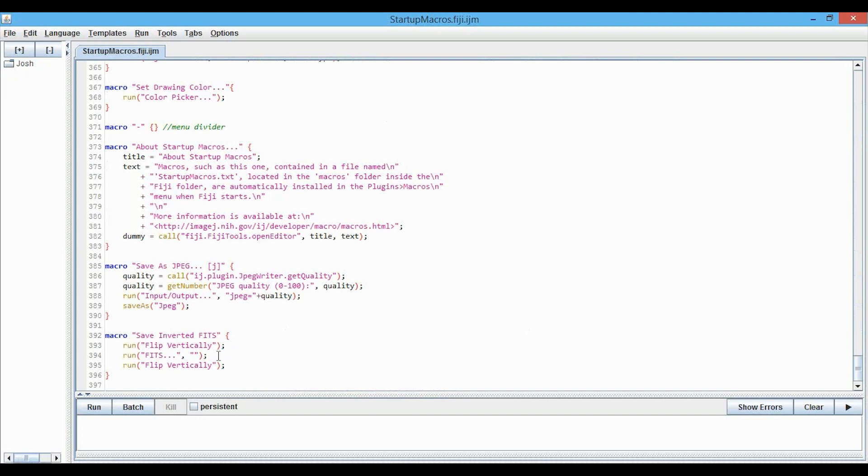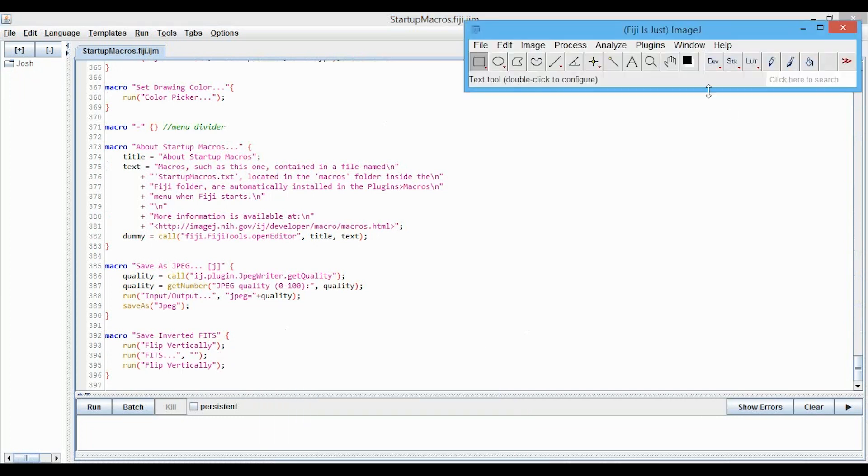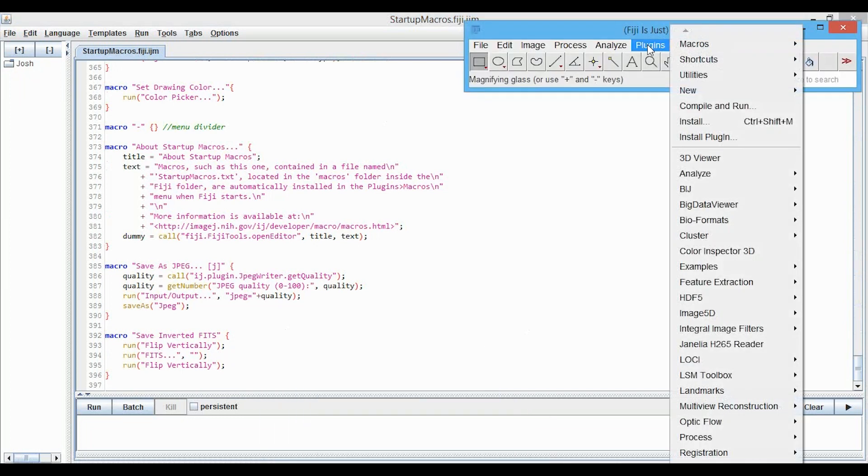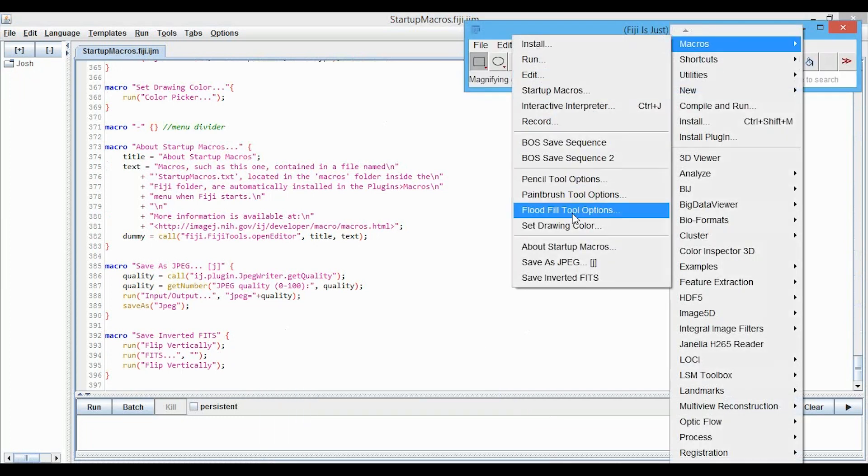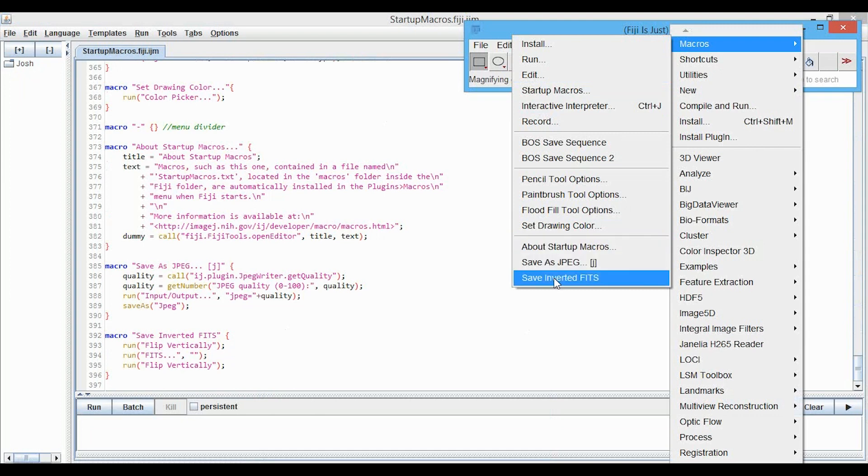And we can take a look in the Plugins Macro menu here, and you can see down at the bottom, we have that Save Inverted Fits, and then we also have Save As JPEG, etc.